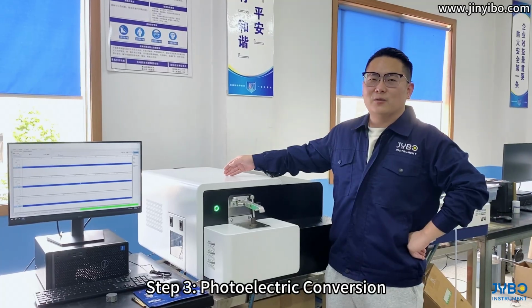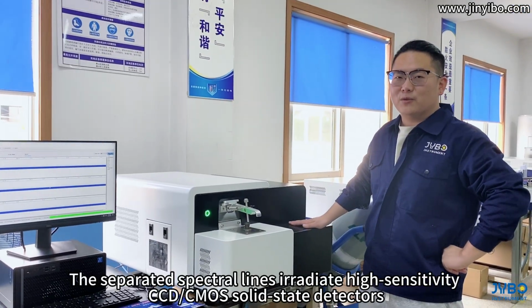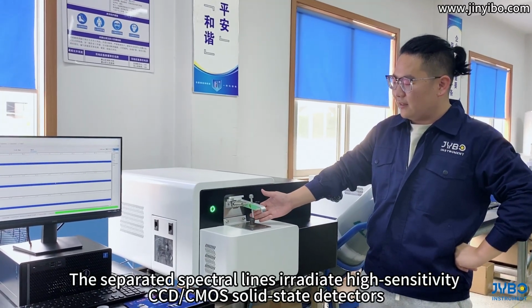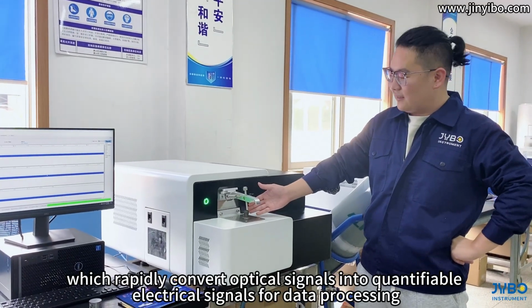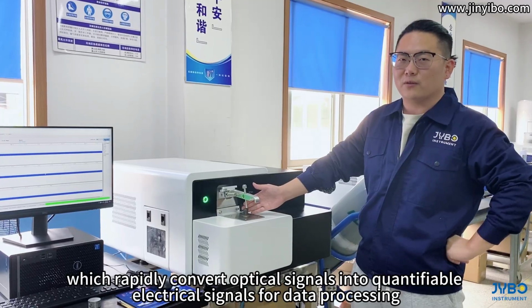Step 3. Photoelectric conversion. The separated spectral lines irradiate high-sensitivity CCD or CMOS solid-state detectors, which rapidly convert optical signals into quantifiable electrical signals for data processing.